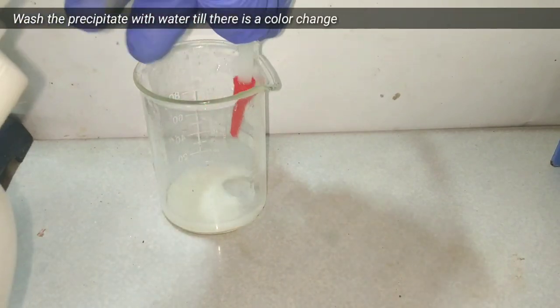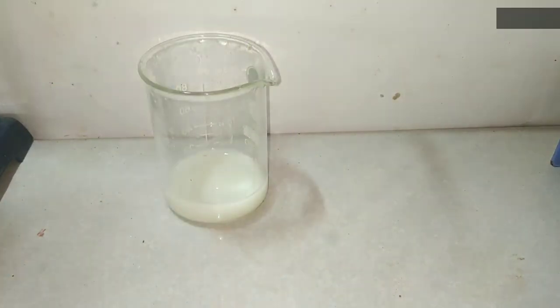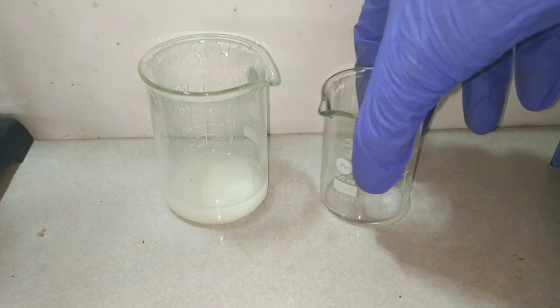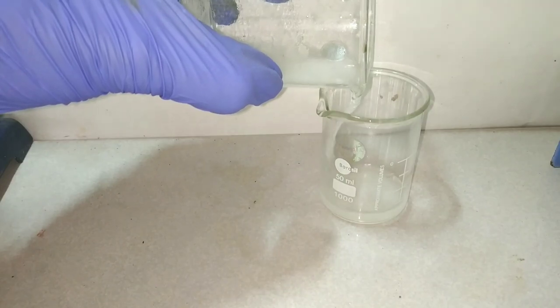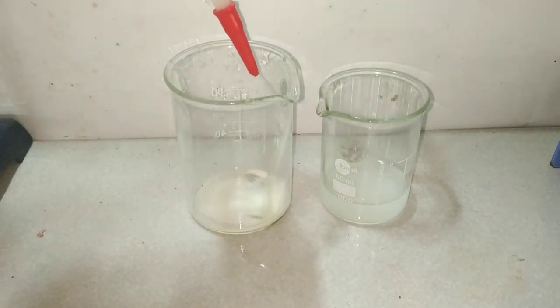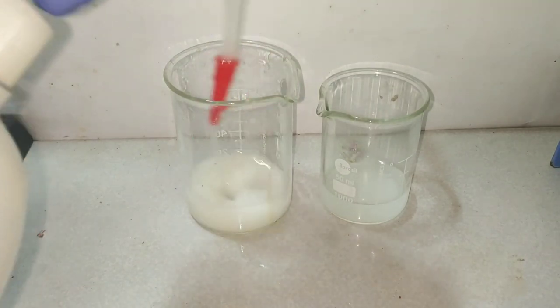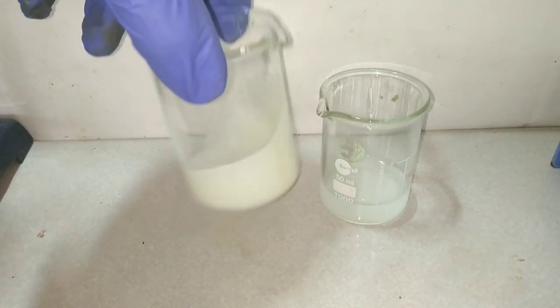Now we will have to wash the precipitate a couple of times with some distilled water to remove any unreacted compounds and other impurities present in the salt. You can easily wash it by adding distilled water and decanting the solution. We continue washing until the color of the precipitate starts turning darker.